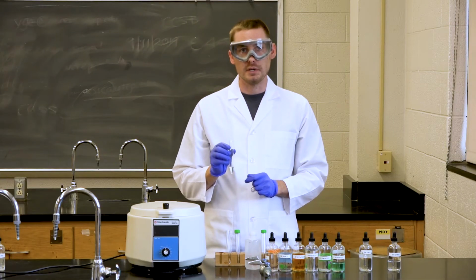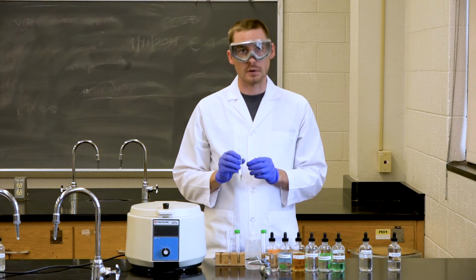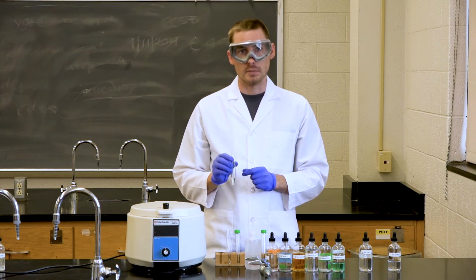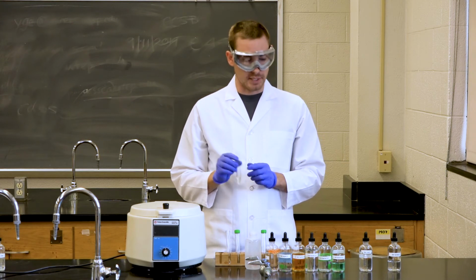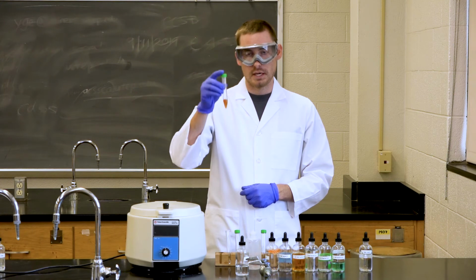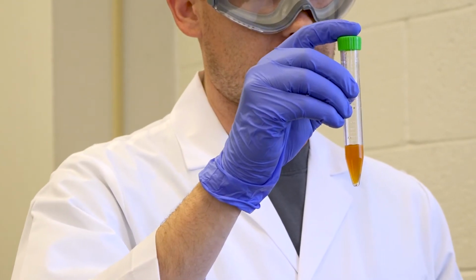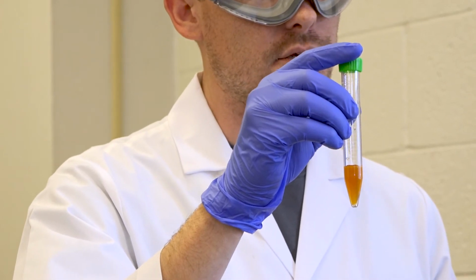So to test tube B, which contains the liquid that we separated from the first test tube, we're going to add 9 molar ammonium hydroxide to this to make it basic. As you can see, we now have a red precipitate. This is iron hydroxide. We can then separate it using the centrifuge like we did before.